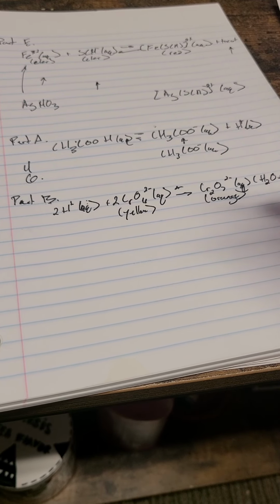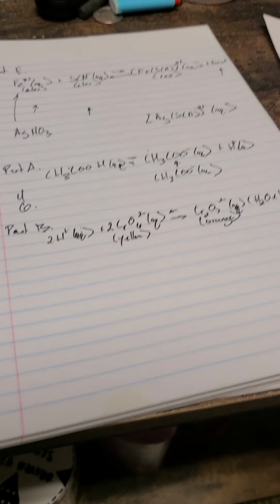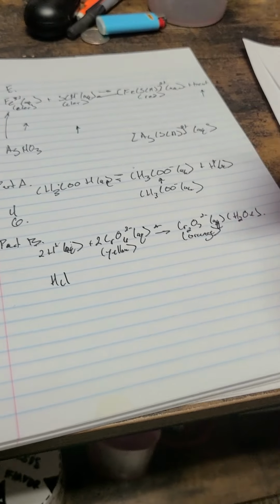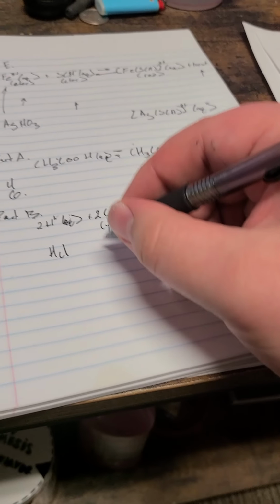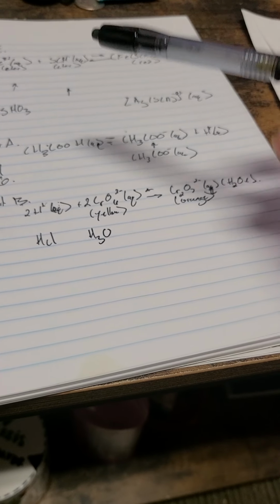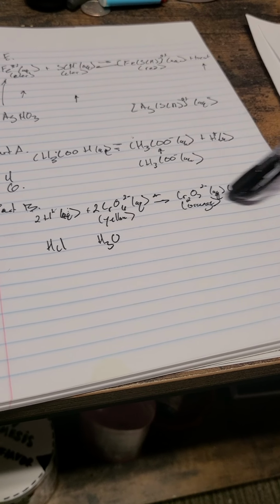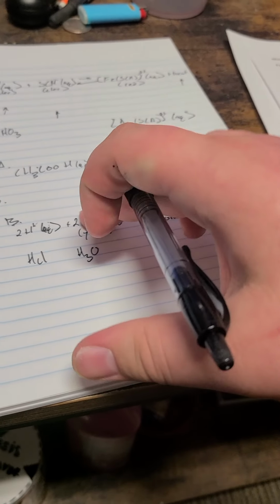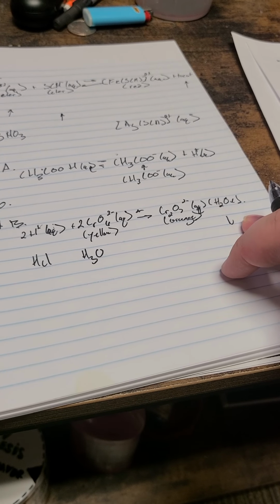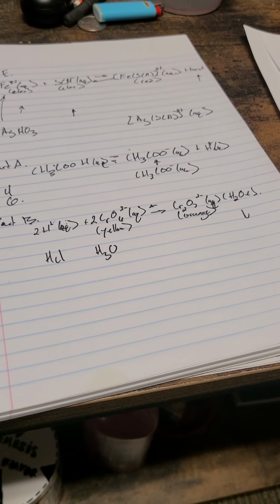First HCl is added, causing a darker orange to appear in the solution. HCl is a strong acid, which would take away from the H2O over here and create H3O. This would cause there to be less H2O to be formed to perform the reverse reaction. So H2O would decrease, and that would cause an equilibrium shift to the right, so more orange appearing, thus the darker orange color of the mixture.